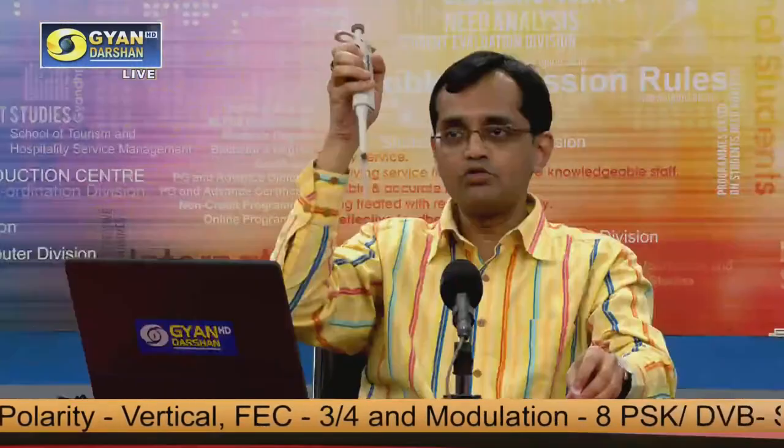Let's say this is solution 1. I hope you got the point of how you have to use this instrument. You have to be careful and handle it gently, because these instruments are costly. Some of them are quite costly, and if it is damaged, then it needs repair, and that needs some expenses. So you have to be careful while handling these instruments.